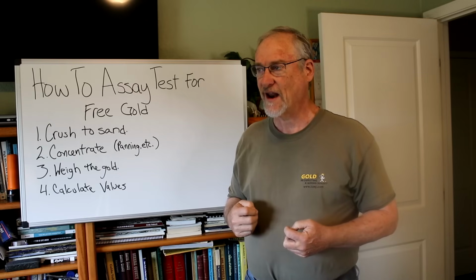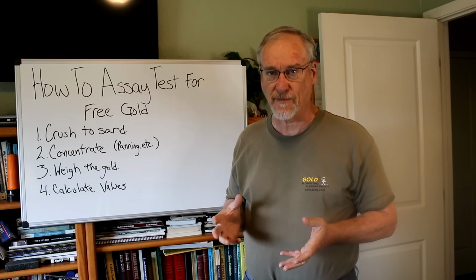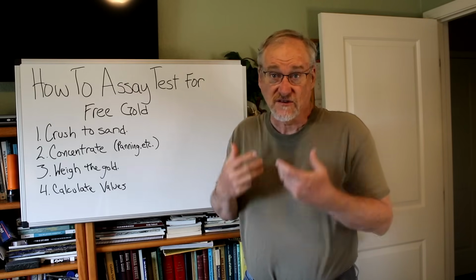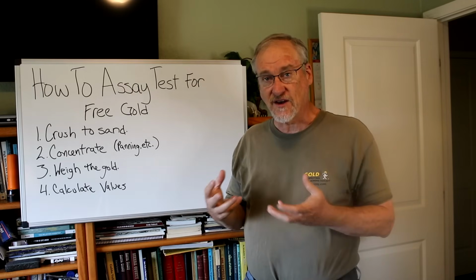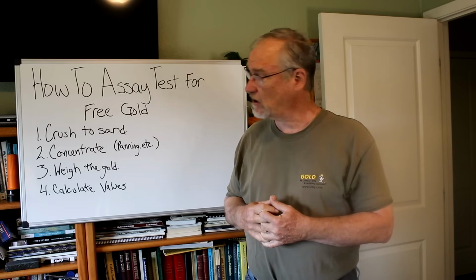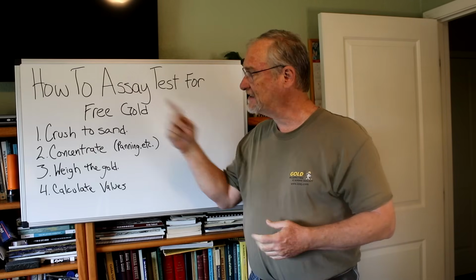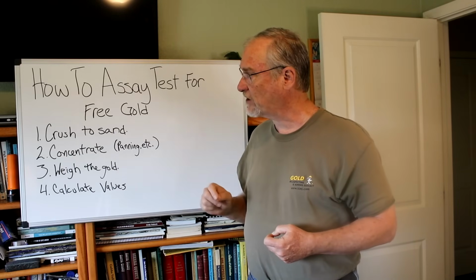And what I tell people a lot of times is you just can't look at a picture and know magically how much gold is in there. So I'm going to talk to you about how to test rocks. You want to test a rock? You think you might have gold? Okay, good. That's great. Let's test it and see how much free gold is in it. And that's what we're going to talk about today.